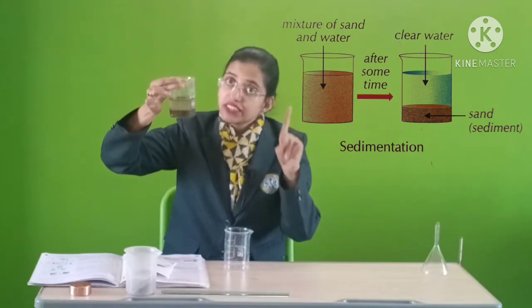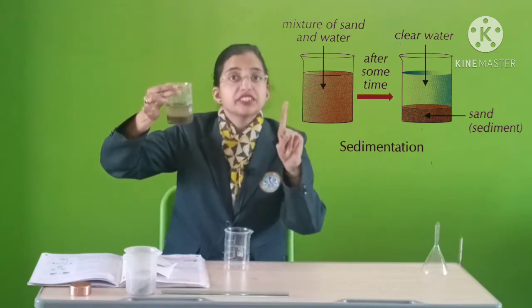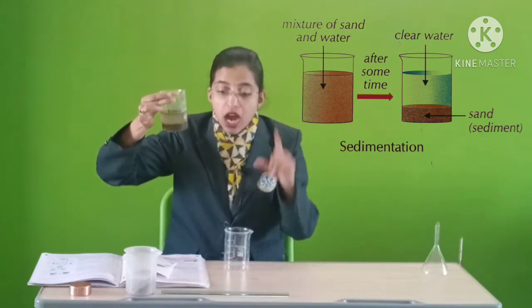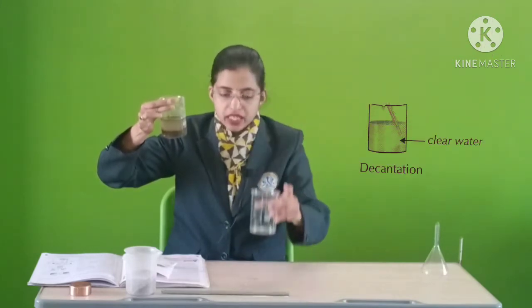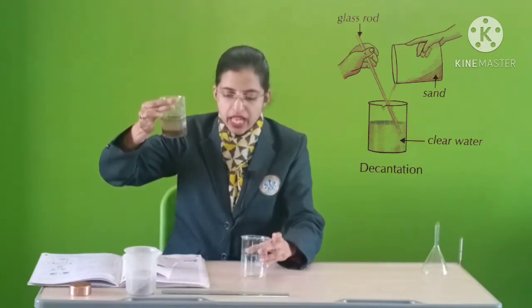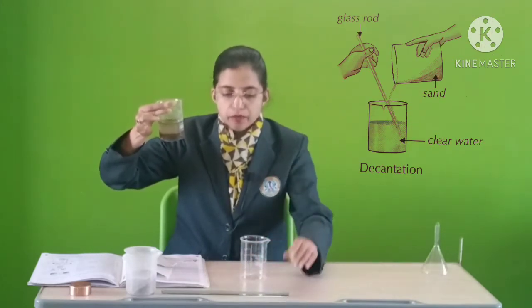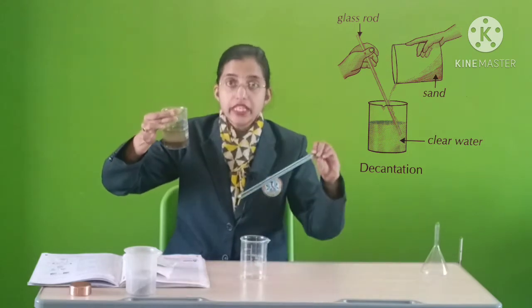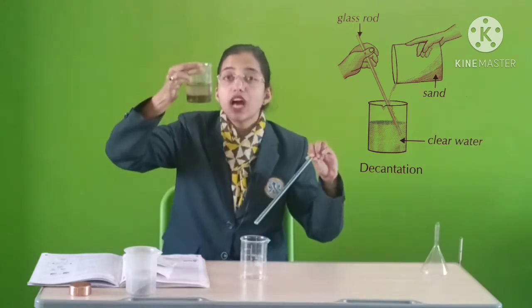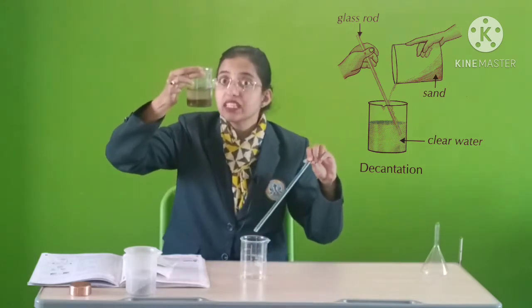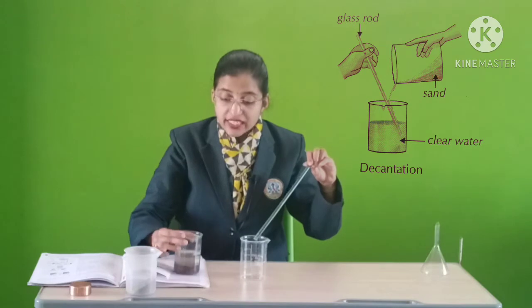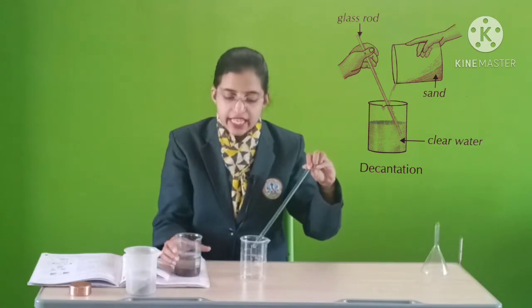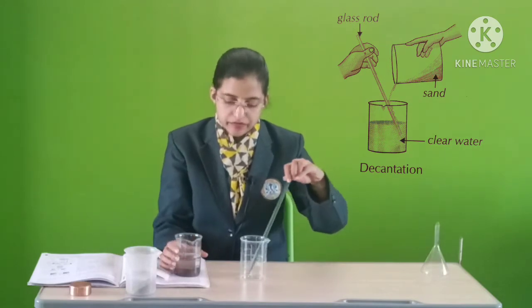This was the first step — sedimentation. Now, decantation. I have a clean beaker here, and now I will pour this water without disturbing the sediments. This is known as decantation.